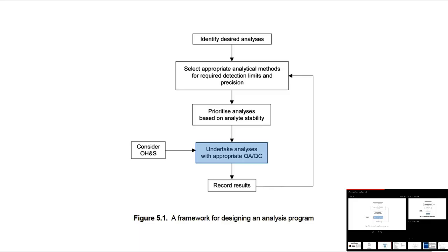Very importantly are a wide range of quality assurance and quality control procedures, and we talked about these in the field sampling component, and they are equally important in this laboratory component. And there's a lot of information, a lot of protocols around ensuring that when a laboratory analyzes your sample, they do not introduce errors, inaccuracies, or contamination into the analysis. And so this is a very, very critical component, and we'll talk about that in the module as well.